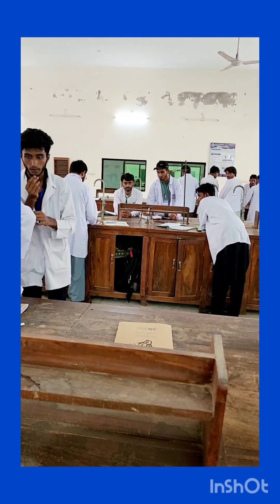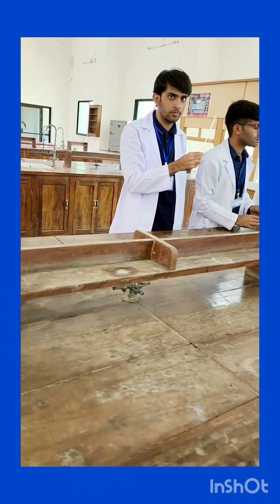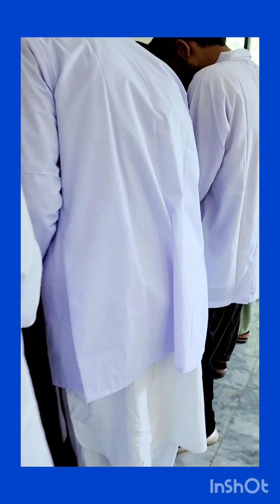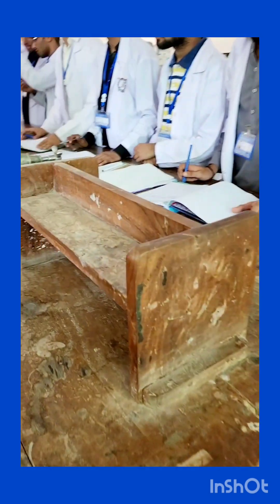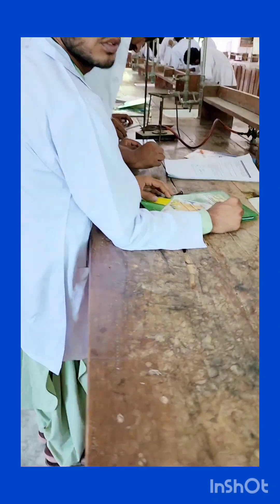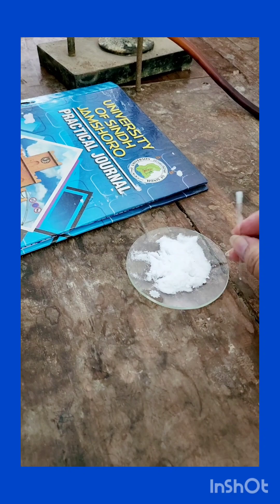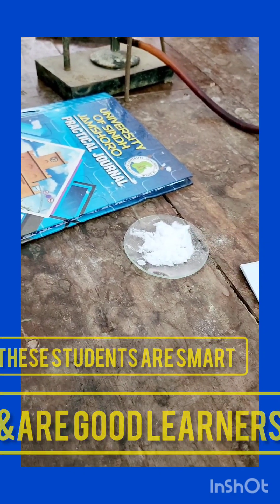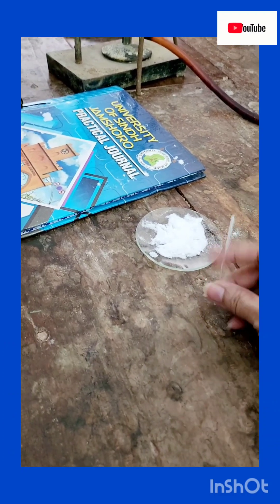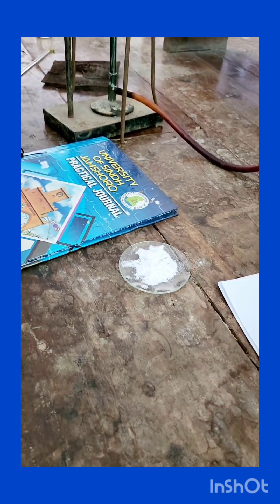Why is your burner on? Please put off your burner — don't put on your burners without any purpose. Now, let me show you how to fill: seal the end, hold it from the top, and tap it until the compound reaches down. Tap it like this — it will start filling.